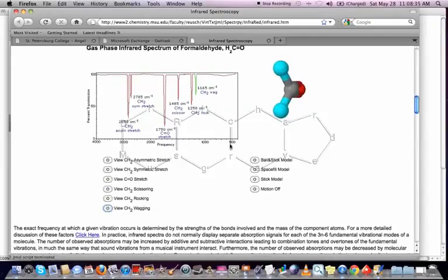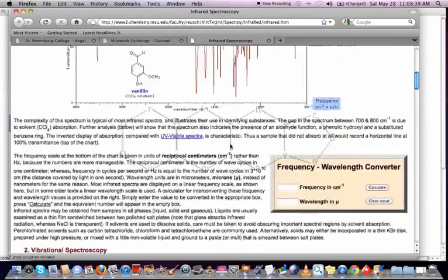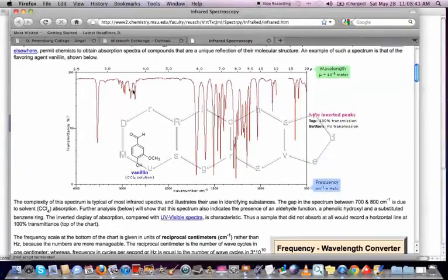You can all go and take a look at that yourselves at some point, but I just wanted to make the point that that's what infrared radiation does. These peaks here represent absorption of that infrared radiation. And since we know that certain functional groups are going to absorb in certain places, this is going to allow us to determine what kind of functional groups we might have in a given compound.